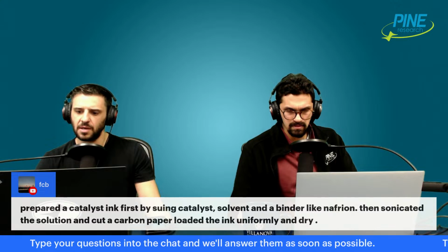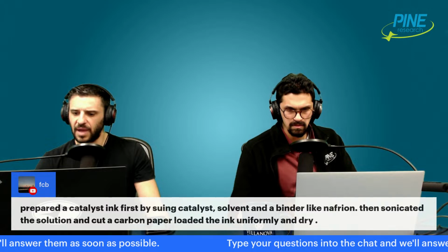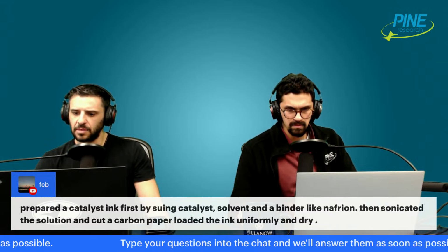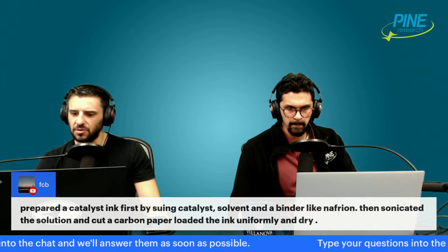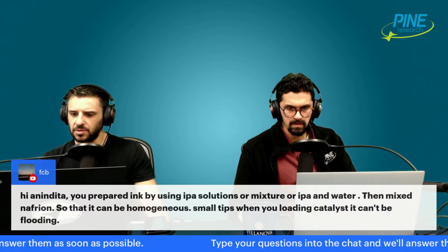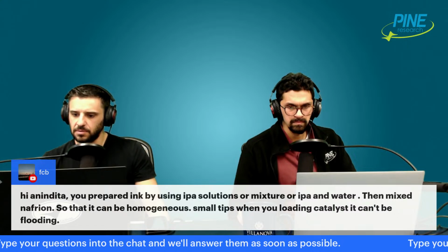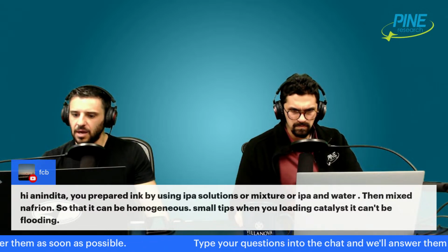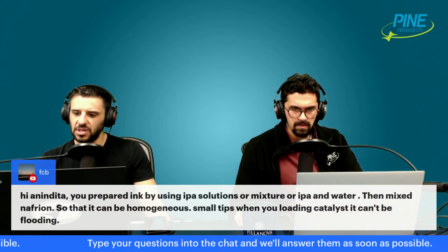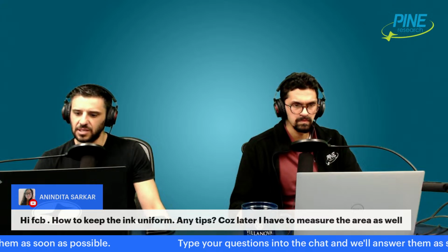Prepared catalyst ink by, I assume, measuring catalyst, solvent, and a binder like Nafion, sonicate the solution, cut the carbon paper, and load the ink uniformly and dry. You use IPA, isopropanol, or a mixture of IPA and water. That's right, different procedures have different mixes here. Mix with Nafion, so it can be homogeneous. Small tip: when you load in catalyst, it can't be flooded. And so Anindita had replied, how to keep the ink uniform, any tips? Because later you have to measure the area.